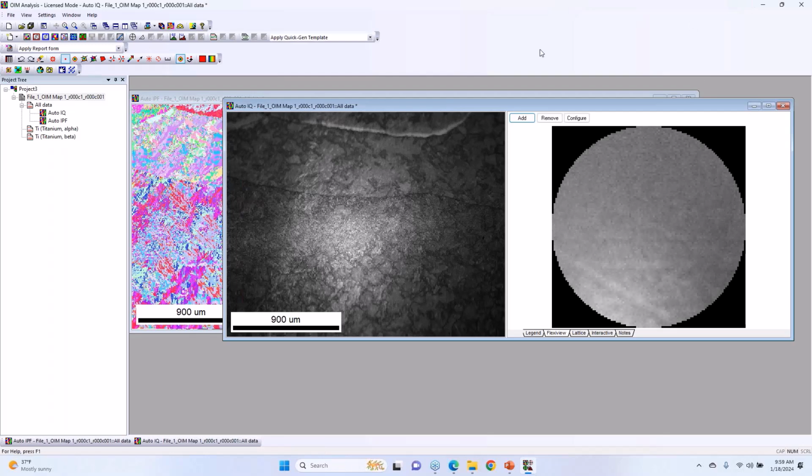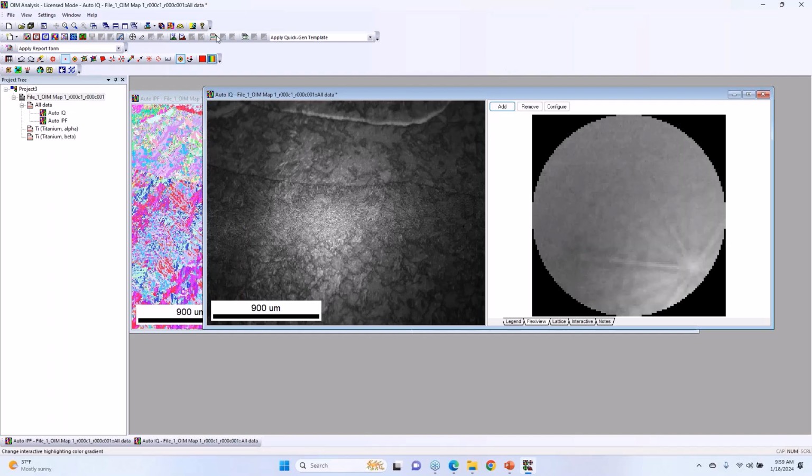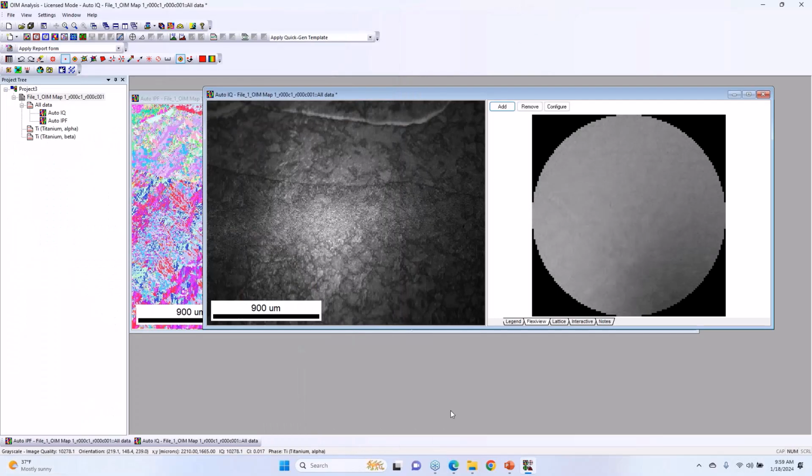So usually when I set it up, we have an option in Montage of, do I want to look at my regular rectangular aspect ratio? I usually use a square field of view, because this is where it's worse, out at the corners, because you're at your maximum in two directions. So I'll turn that off to crop that into a square. It means I have to have more tiles, but it will stitch those together.